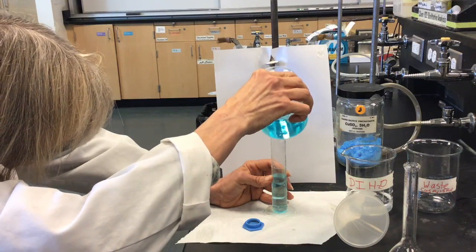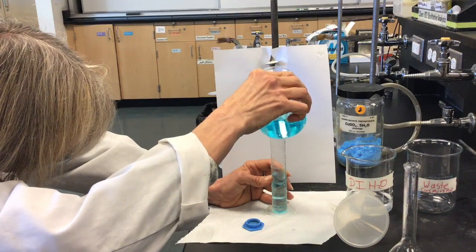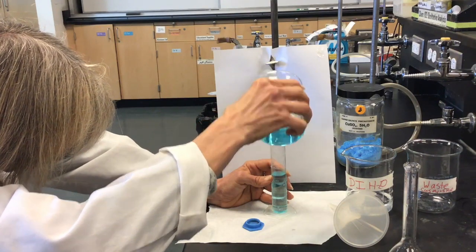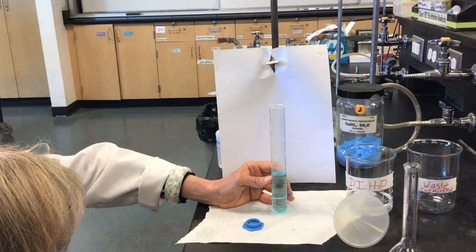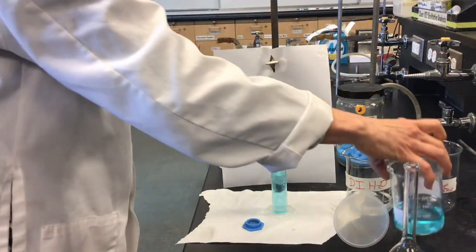And our graduated cylinder reads to 1 decimal place. So if I get the bottom of the meniscus exactly on the line, then I would call that 25.0. If you're a little above or a little below, you just want to make sure you record your exact volume.